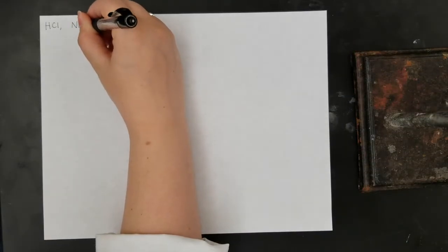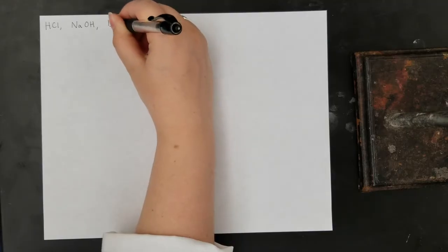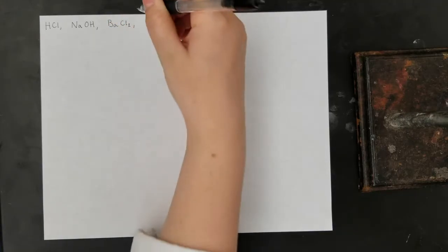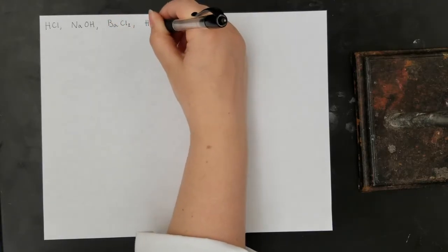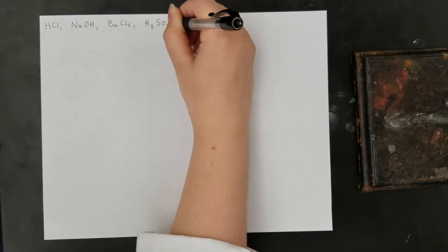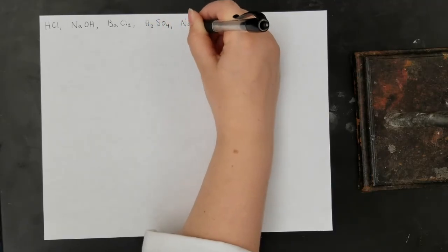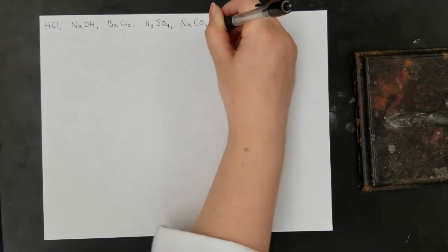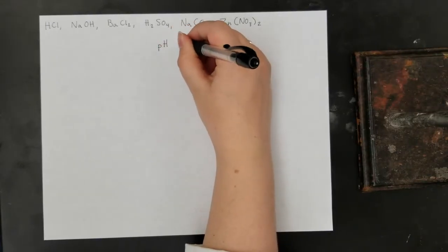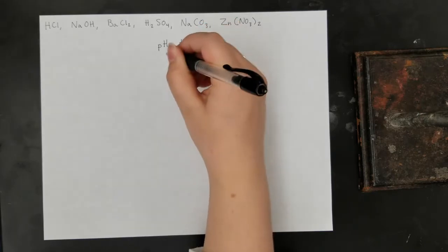Suppose that we had to identify the following 6 clear, colorless solutions: hydrochloric acid, sodium hydroxide, barium chloride, sulfuric acid, sodium carbonate, and zinc nitrate. To guide us in our efforts to identify our 6 solutions, we'll create a flow chart to aid us in the procedure.